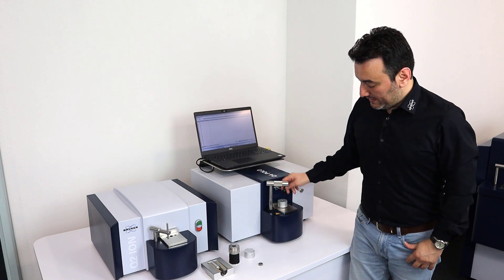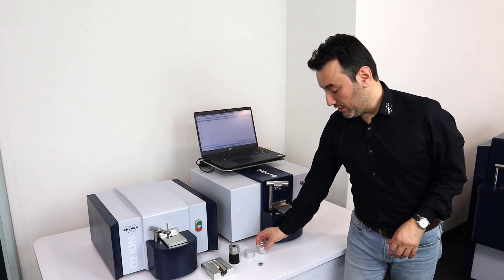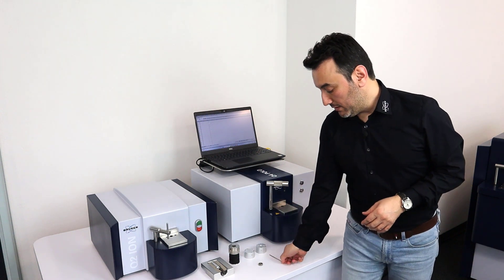So these are the sample adapters available for the Q2 Ion and the Q4 Polo. Now I'm going to move over to the Q4 Tasman and show you some other adapters.